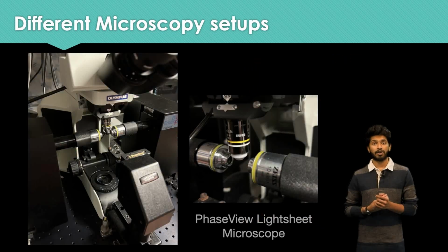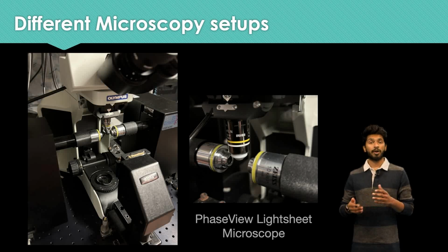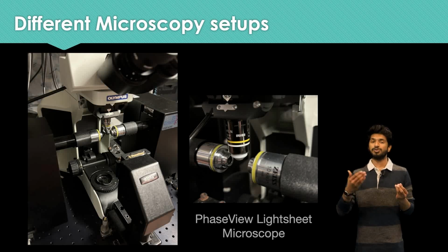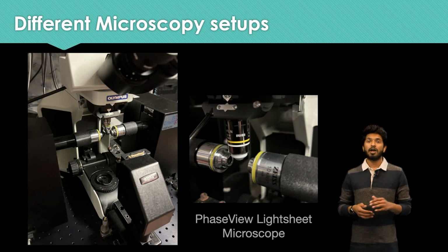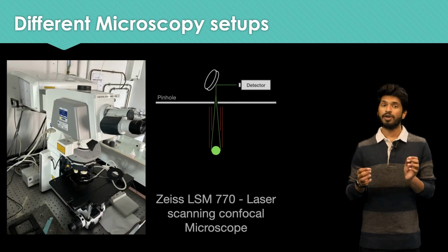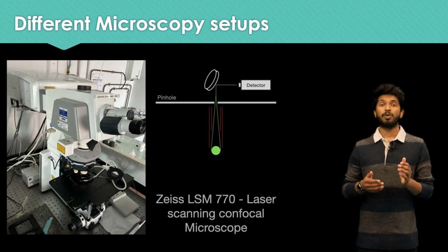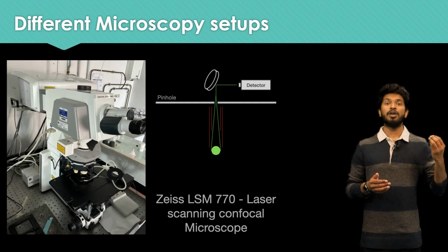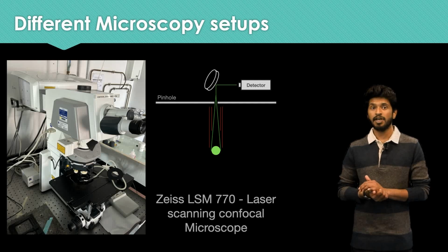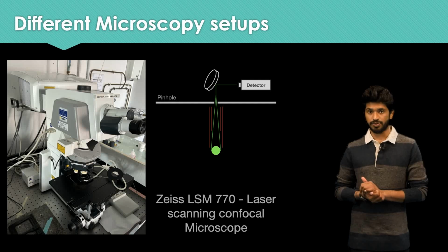After this, light sheet microscopy is also a relatively new technique that has become popular in the field, also employing the use of lasers to illuminate a single portion of the sample and focusing on it to see the component. Confocal microscopy uses a fluorescence, but most importantly employs a pinhole to avoid background and noise from the illumination. The principle of confocal microscopy is modified with the addition of a spinning disc or many other alternatives to illuminate the sample only as much as it's required and observe this individually.